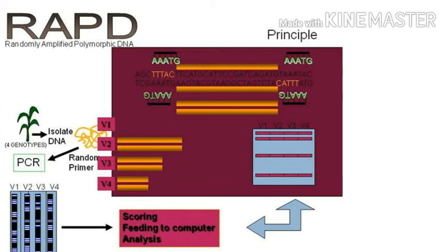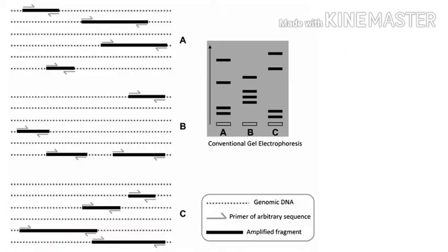PCR primers are made using the chosen sequence and a PCR reaction is run using the total DNA of the organism as a template. Every now and then a primer will find a correct match, purely by chance, on the template DNA. For PCR amplification to occur, there must be 2 such sites facing each other on opposite strands of the DNA. The sites must be no more than a few thousand bases apart for the reaction to work well.